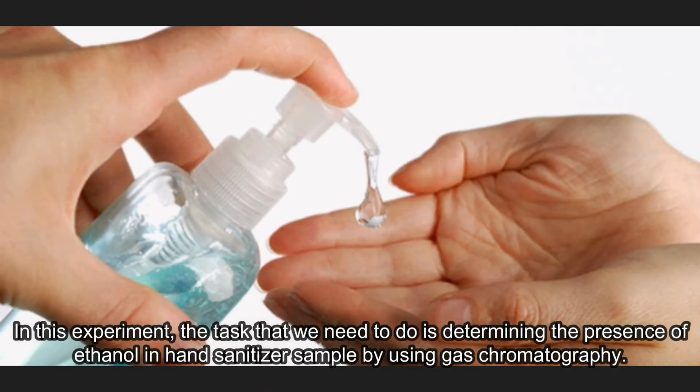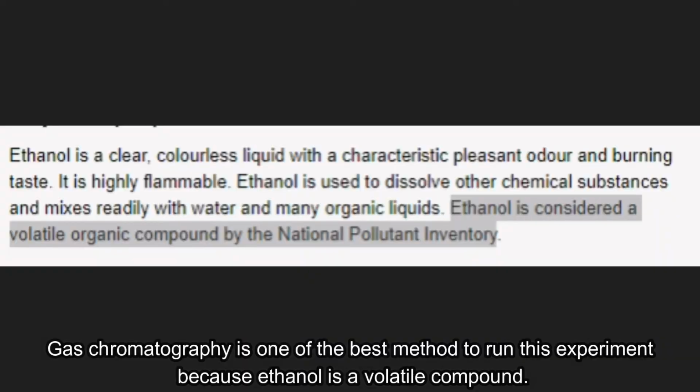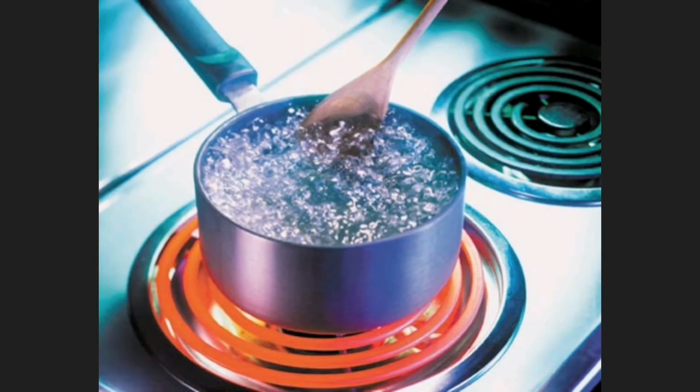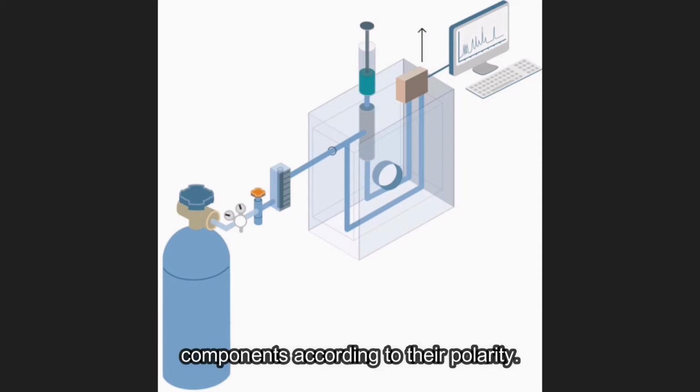In this experiment, the task that we need to do is determining the presence of ethanol in the hand sanitizer sample by using gas chromatography. Gas chromatography is one of the best methods to run this experiment because ethanol is a volatile compound. By using the gas chromatography method, the volatile compound of interest can be primarily separated based on the boiling point. In addition, the GC column with polar selectivity also can provide additional intermolecular interaction like dipole interaction to separate the individual components according to their polarity.